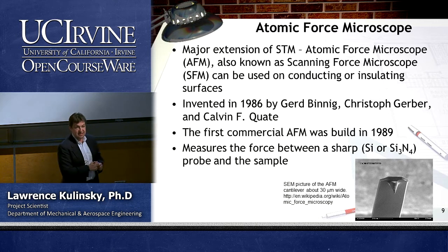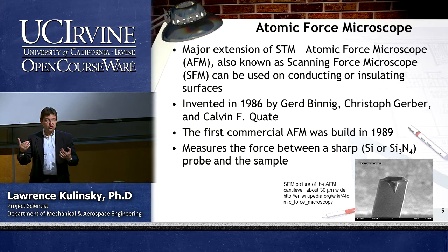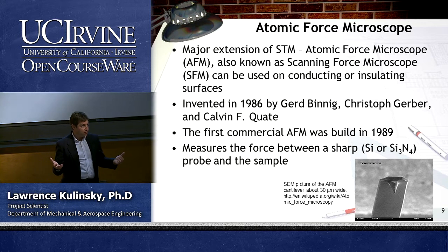I don't have it on this slide. Great. So what kind of surface forces do you know? Absorption? Well, it's not a force, right? But do you know, let's say, capillary forces? Let's say, van der Waals, there are many different forces.